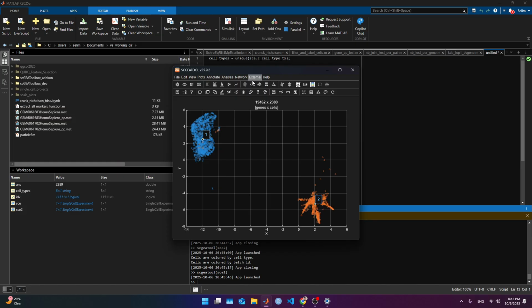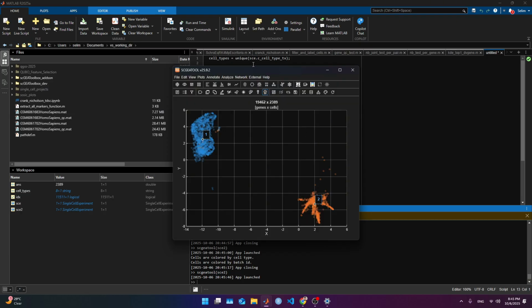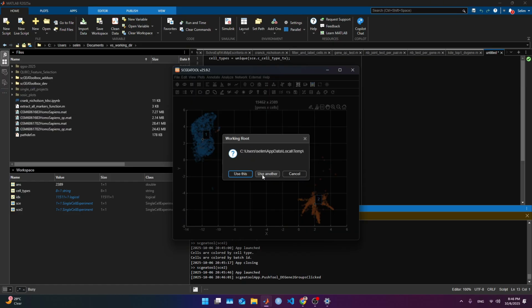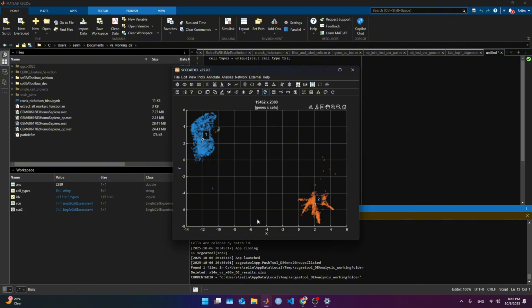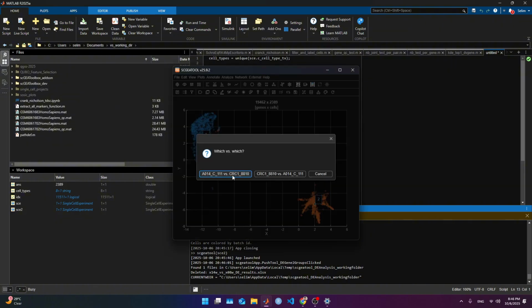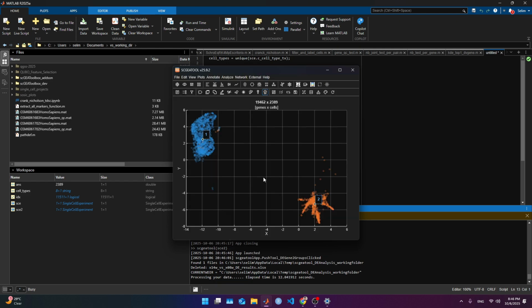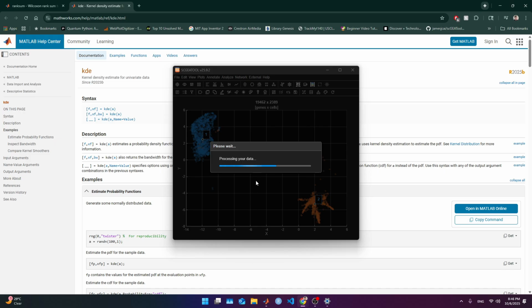Okay, first, let's look at the differential expression. This is kind of cheating, but it should be fine for the purposes. So what we're going to do is differential expression, the new, use this one, yes, override, and it's going to be by batches. Compare the two of them. It doesn't matter the order. We are going to inspect ourselves. I'm going to stop it and come back. Yes, and whatever. Okay. And then it has to open the location.